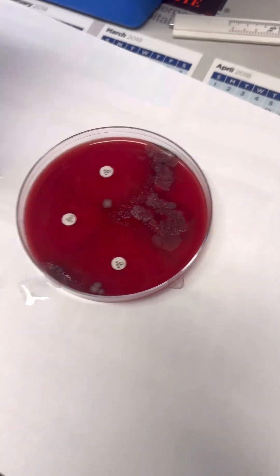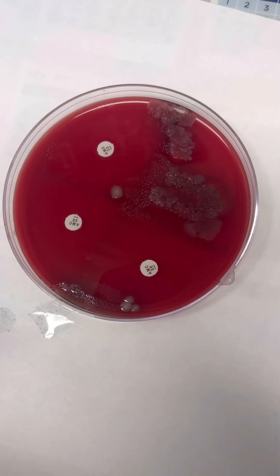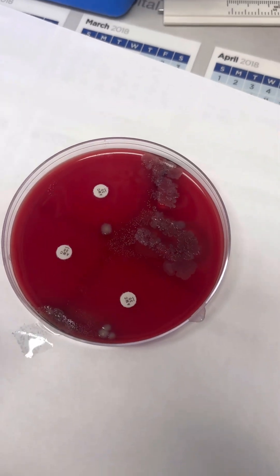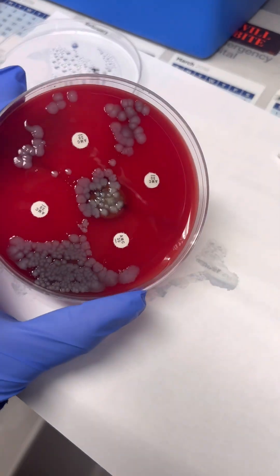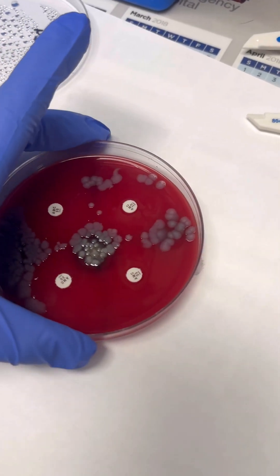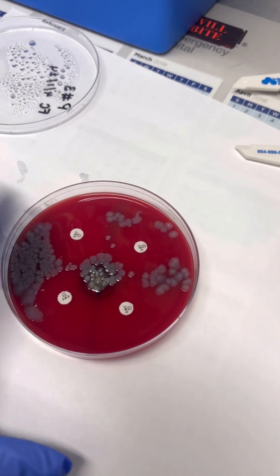This culture is from urine from one of the patients. There's been a little bit of growth. Now I'm going to measure the inhibitory zones. This is also another culture from urine. As you can see, this one definitely has more bacteria, and again I'm just going to measure the inhibitory zones.